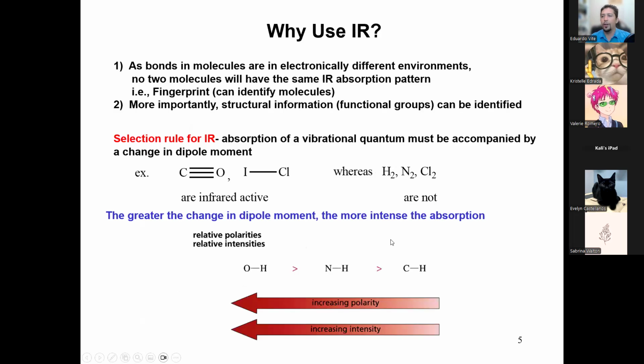So why do we use IR specifically? Like I mentioned earlier with the concept of the glass cup, it just so happens that the IR wavelengths resonate with the bonds. If we imagine the bond as a spring, for example, here I have a spiral notebook, and the spiral we can think of as a spring. It's a very weak spring, right? Look, I can bend it, you see? I can bend the spring, and if the paper wasn't attached, I could stretch it out and distort it in all sorts of different ways.